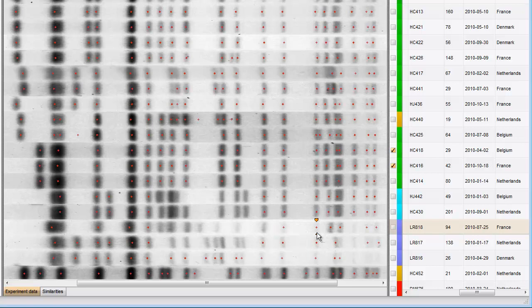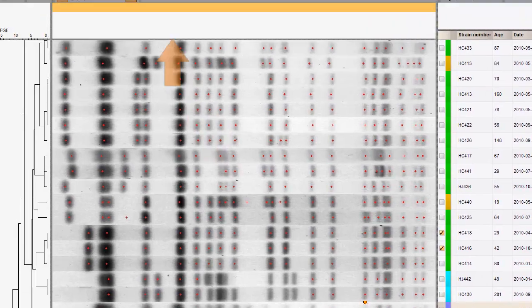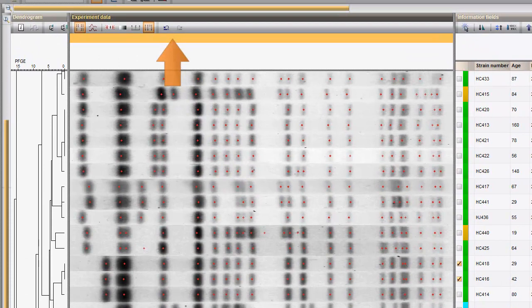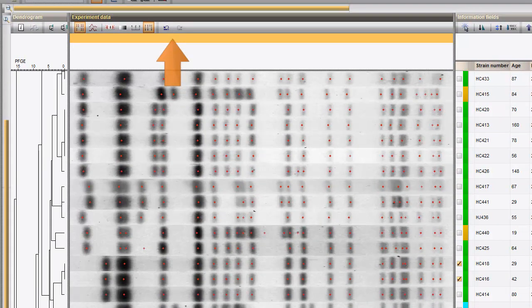Note that there is a multi-step undo and redo function for all band editing.